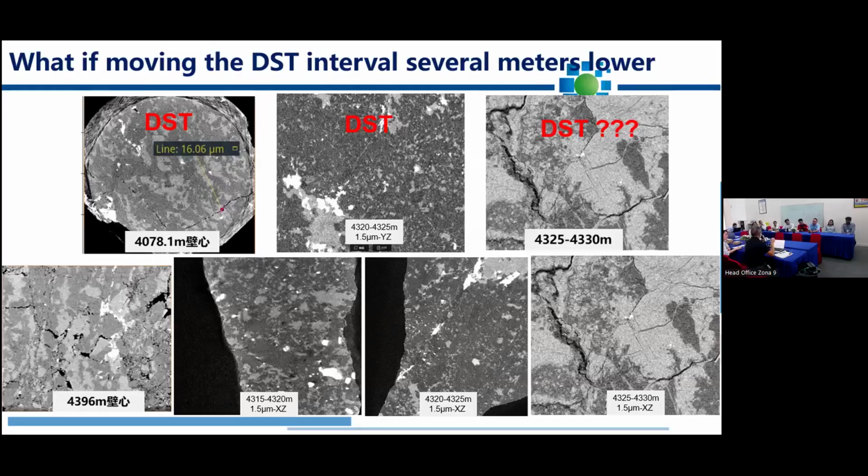Let me explain a little bit more. I get a permeability for each data point, but I cannot measure every point. It's pretty expensive, to be honest with you, because of the technology and the time we spend on each sample. So for each well of, say, 100 meters of interval, we can do 50 samples.